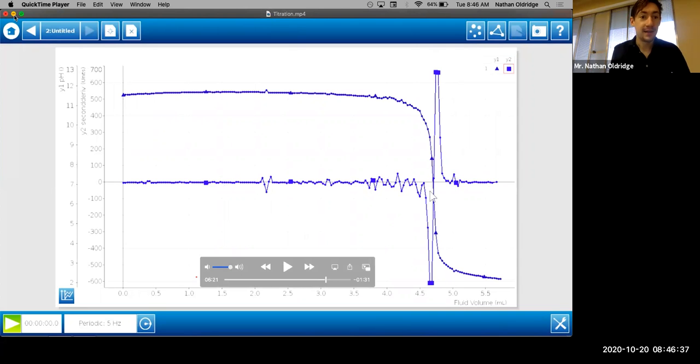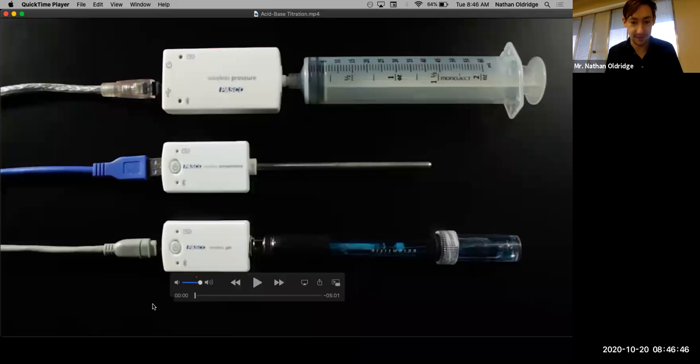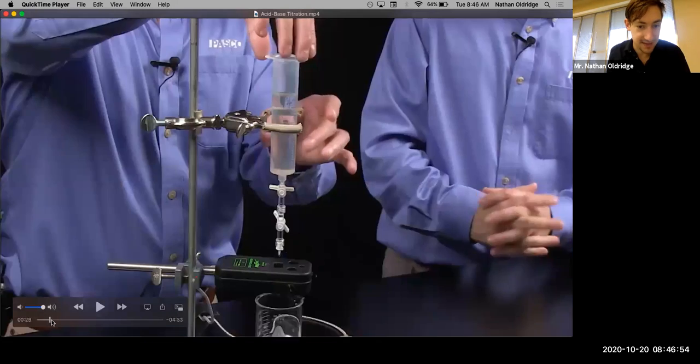A strong acid, strong base titration should neutralize each other to make a pH of 7 at the equivalence point. Now, when you're doing this in an actual lab, often you're not going to have a pH meter handy. So what you do is you add an indicator. I've got a second video here where they're doing something similar to that. Let's fast forward through this ad.